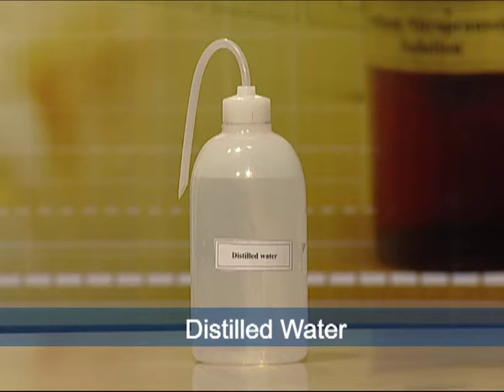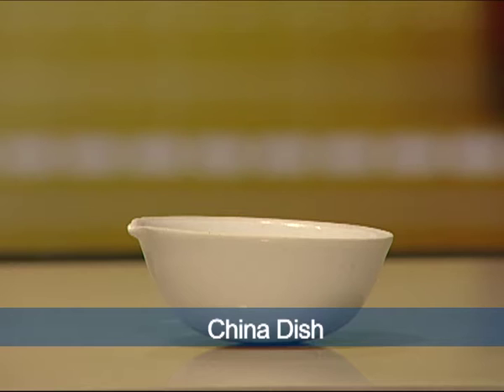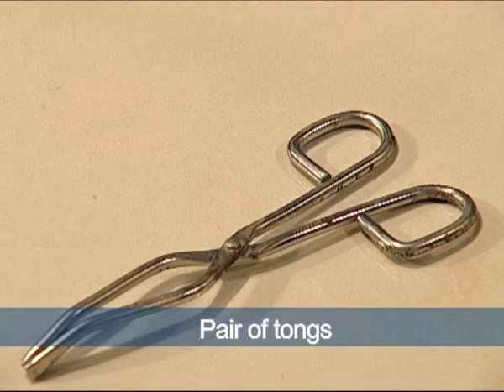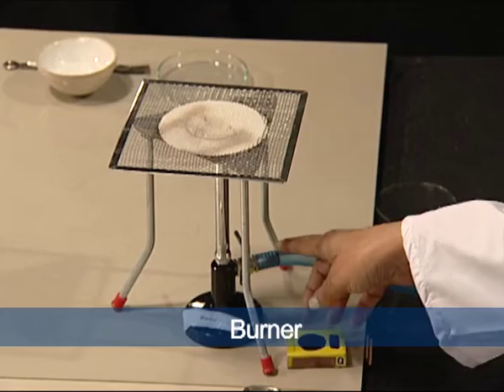Materials required for the experiment are distilled water, glass funnel, measuring cylinder, beaker, china dish, sample of benzoic acid, filter paper, glass rod, spatula, a pair of tongs, tripod stand, wire gauze and a burner.